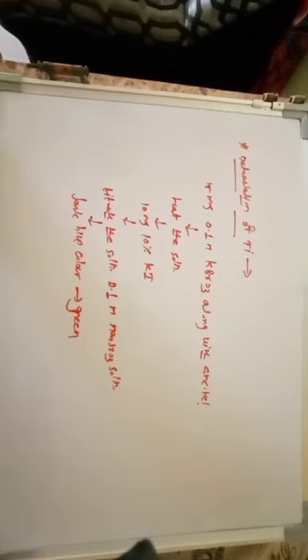You should remember its molecular formula, FeTiO3, its composition, and its dissolution process: you dissolve in acid, evaporate up to dryness, extract with water, and dilute the filtrate to 250 ml. Then take the diluted solution, add tin chloride, mercuric chloride solution, add H2SO4 and H3PO4, add diphenylamine indicator, and titrate with 0.1 normal potassium dichromate for estimation of Fe.